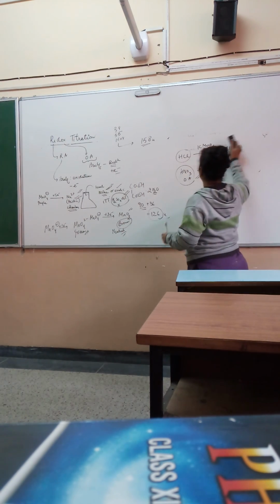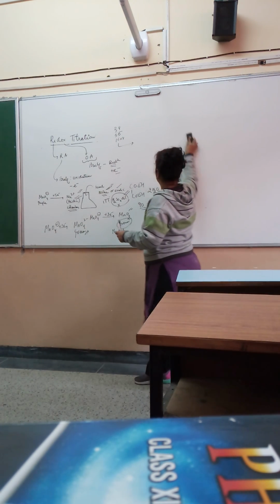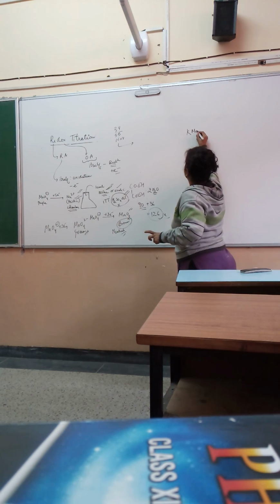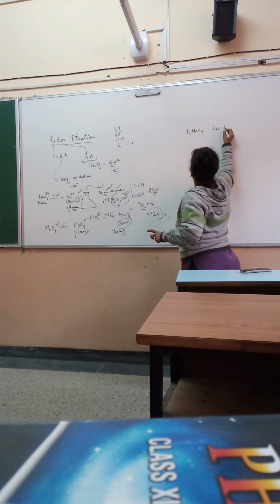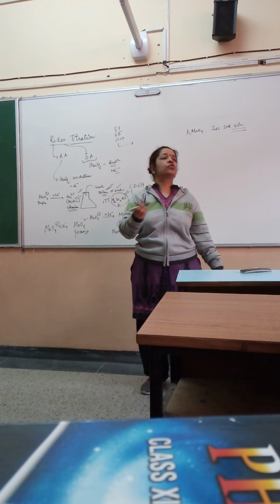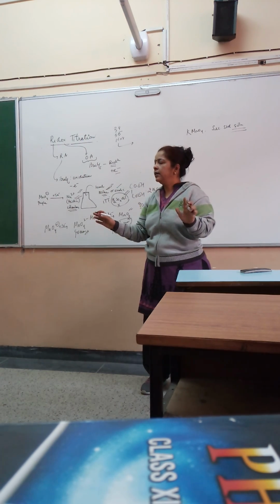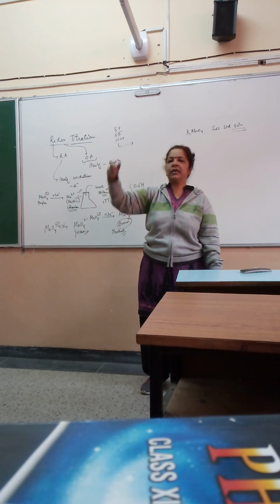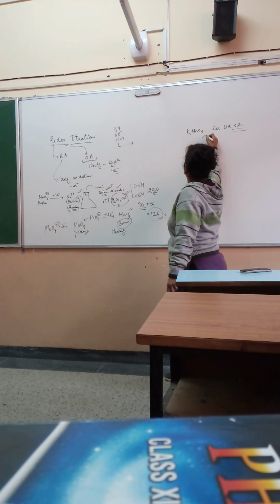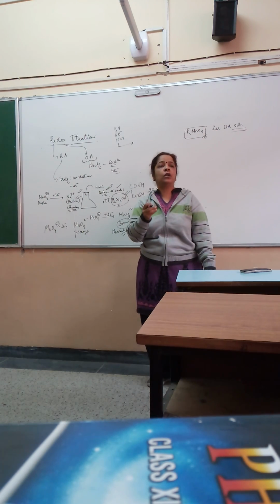How do you prepare the solutions? You are normally asked to prepare one of the two standard solutions. Mind you, KMnO4 is called a secondary standard solution. इसका क्या मतलब? This solution changes with time. आपने जैसा बनाया है वो वैसा रहता ही नहीं. It reacts with the atmosphere, reacts with the container, any impurity, it reacts and leads to the formation of some other compounds, hence its concentration keeps on changing.